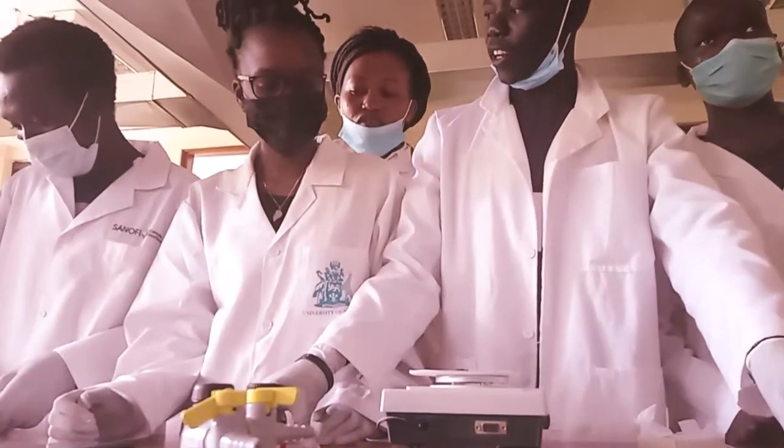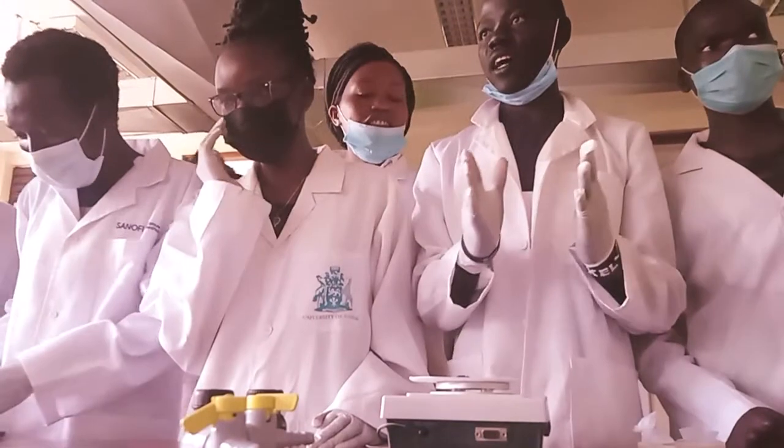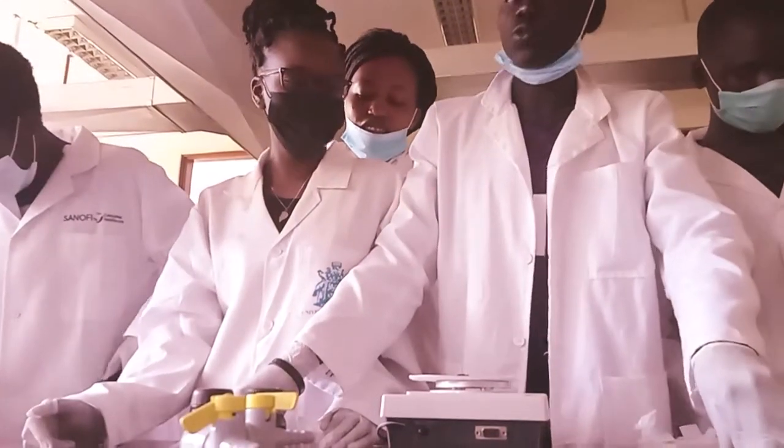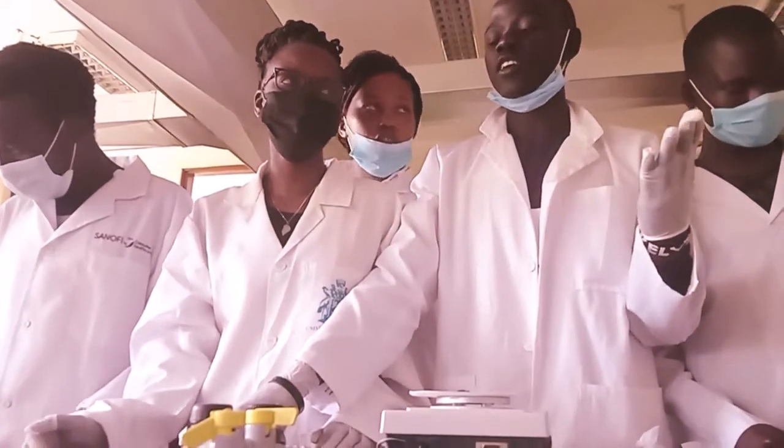What you call peptidoglycan — its thickness and arrangement. At the end, it can also be used to see the pseudo-hyphae base.